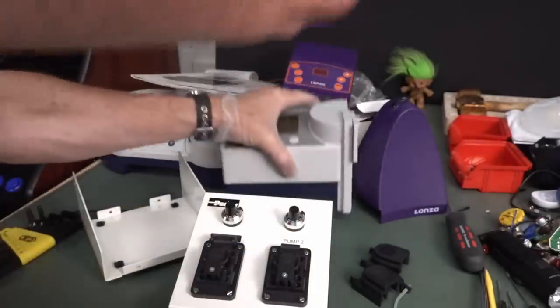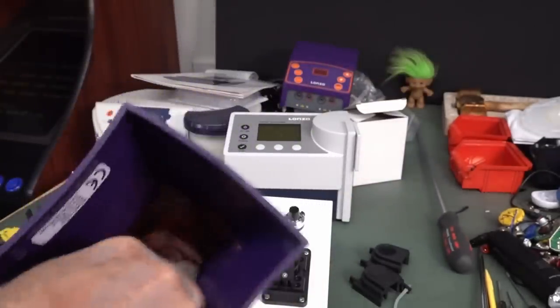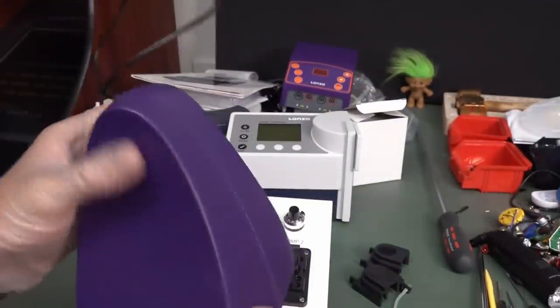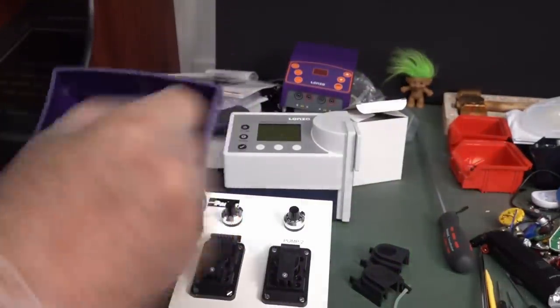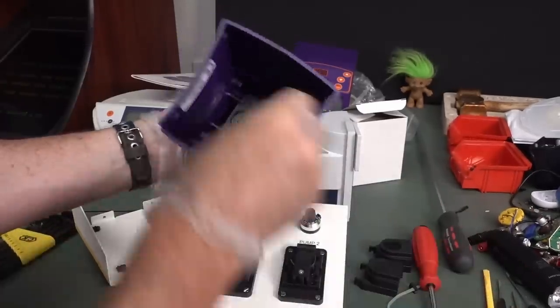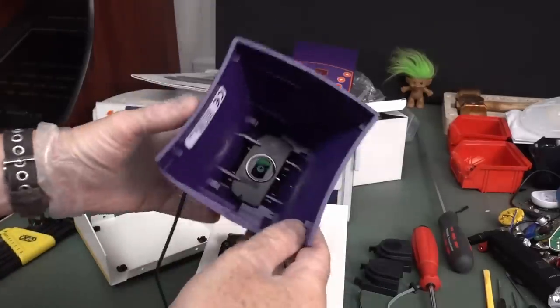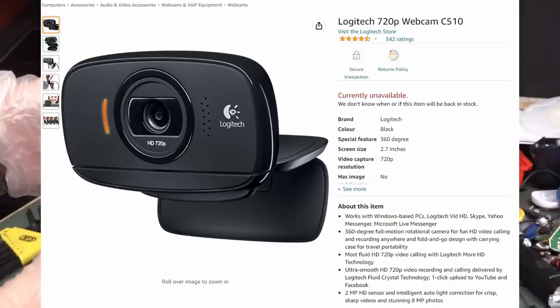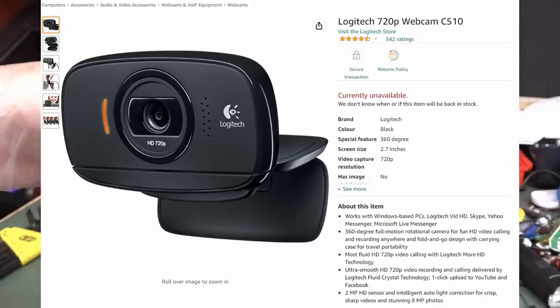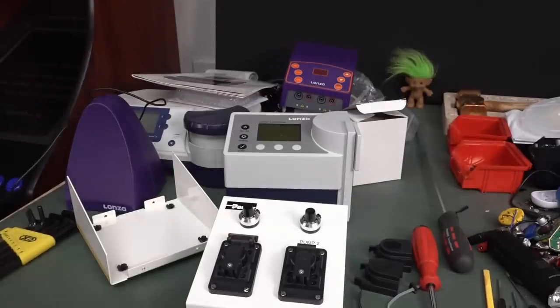The comments down below on that webcam. I wonder what webcam I've got. Can I get that out of there? It's a Flashgel camera. There you go. But it's just a Logitech camera with a little filter on it. It will succumb to my percussive maintenance. There you go. So it is custom designed to fit that little Logitech. It's an HD 720. Oh, it's old. Okay, yeah, it's a 720p. Nothing special there.